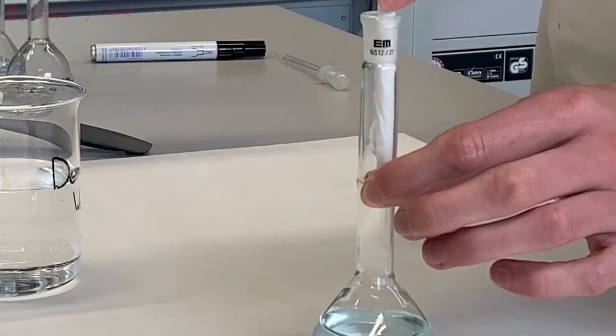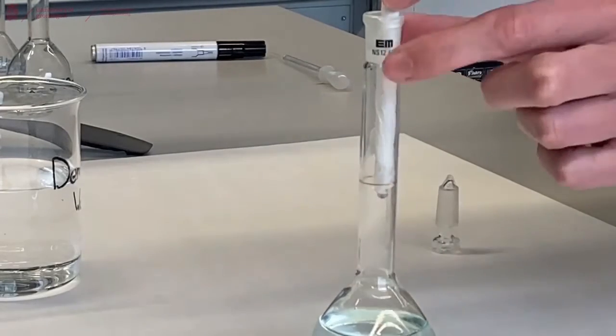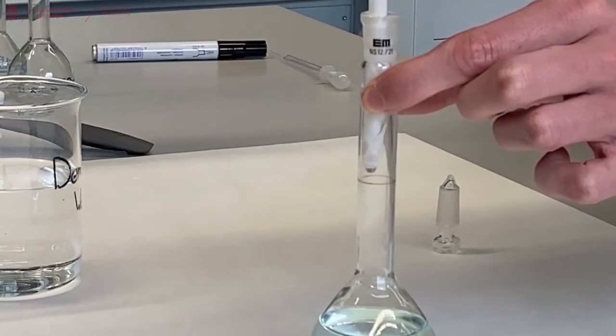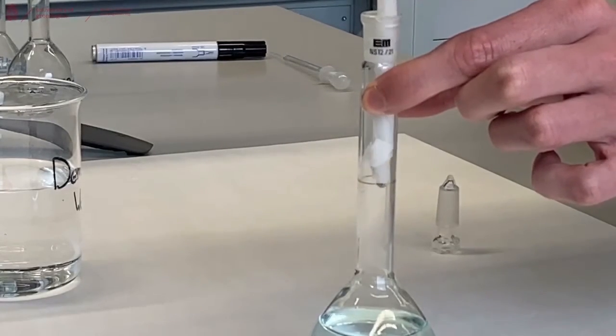Make sure you do not touch the liquid in the bottom part of the volumetric flask, as that will actually remove some of the carefully weighed out solid or liquid that you had to start off with.